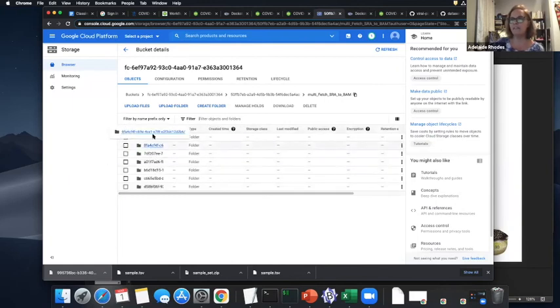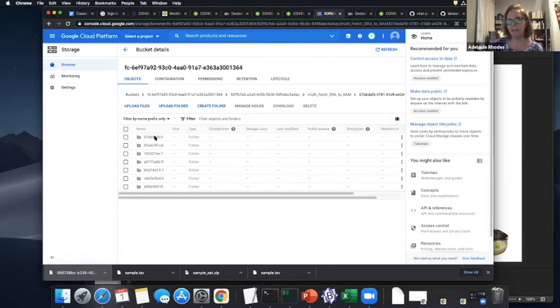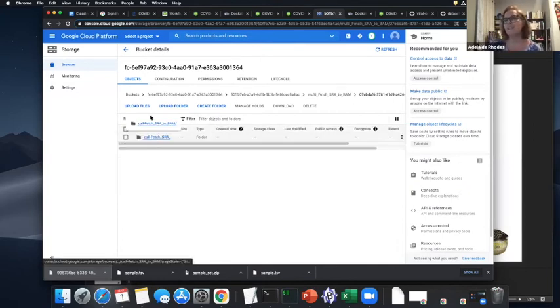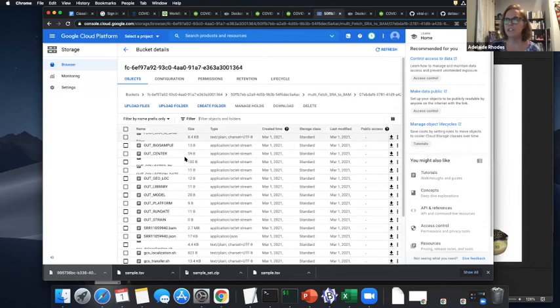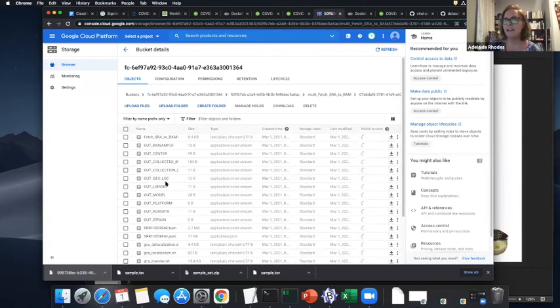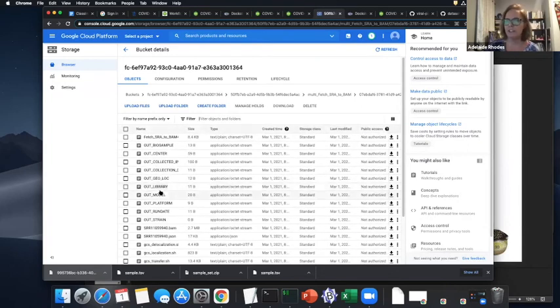So all of this stuff is happening. I'm not going to need any of this if I can replace it. That's kind of why I want to do it, except the metadata. The metadata part does spit out things like the geographic location of the sample. So this is the metadata: the geographic location, the library, the model, the platform, the run date. But if I use BigQuery, that stuff's all in there.